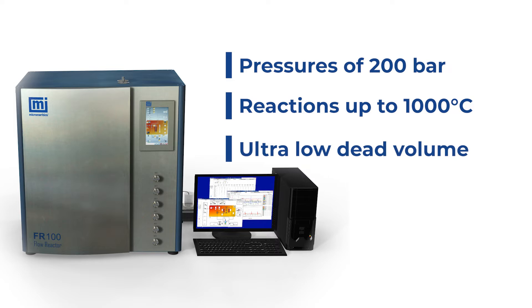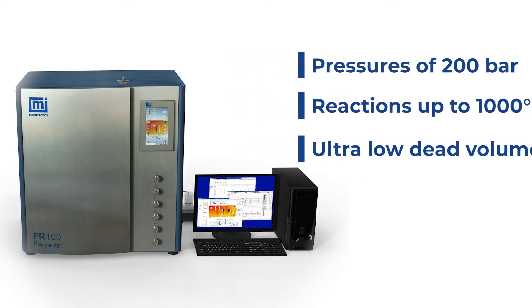In addition, the ultra-low dead volume guarantees real-time results with the highest degree of reproducibility and accuracy.